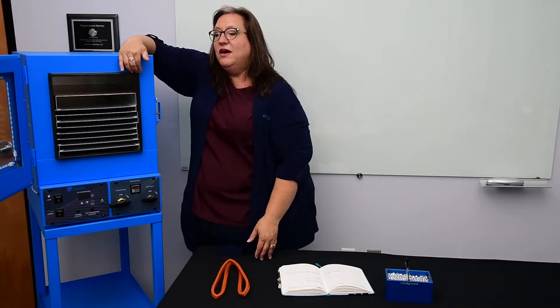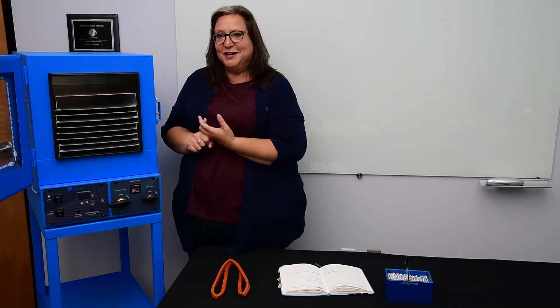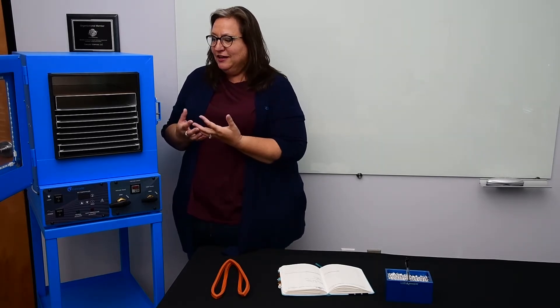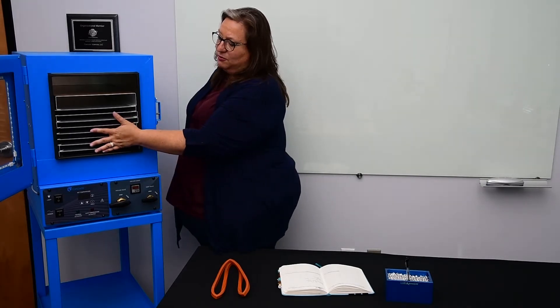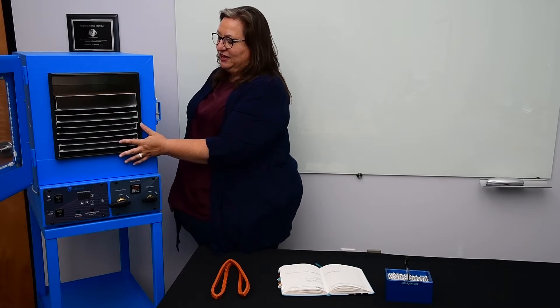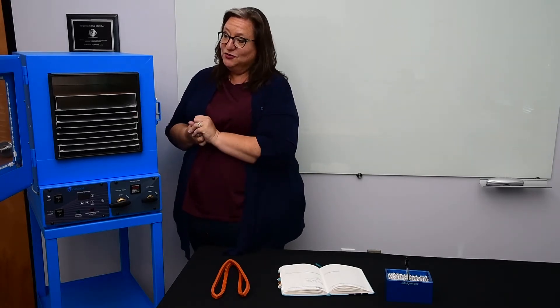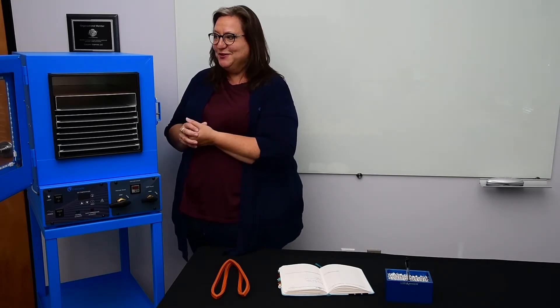If you have an application where you want to expose a product to heat but not vacuum, my suggestion is not to use a vacuum oven. We have water baths for that, we have forced air ovens, we have reactors — lots of different heat-treating equipment that could be proper for that application. Putting open jars or trays in a vacuum oven without running it under vacuum is going to cause you trouble with your gasket, and it's just not the right application for the unit. So if that's your process, give us a call and we can get you set up with other equipment.